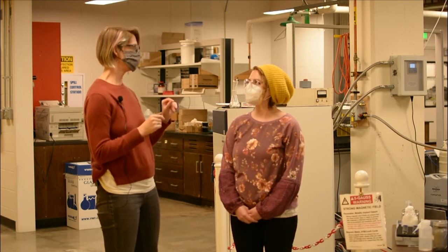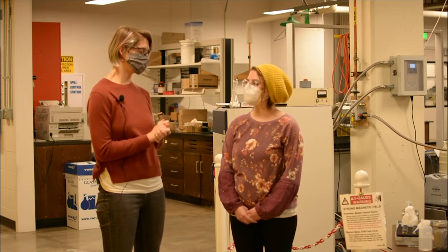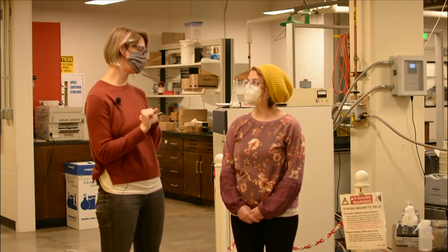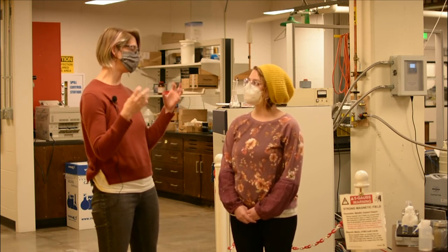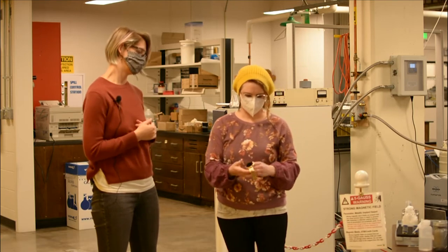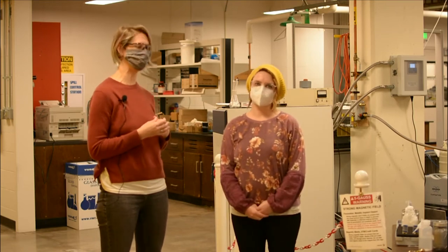What is most important is keeping your body safe. You want to make sure you don't have any metal implants. When you do magnet safety training, ask yourself: do I have any metal in my body that could be magnetic? Do you have any metal implants? Do you have a pacemaker? Do you have anything on your body — jewelry, a watch — or on your clothing that could be magnetic? This will keep your watch safe by putting it on the table.